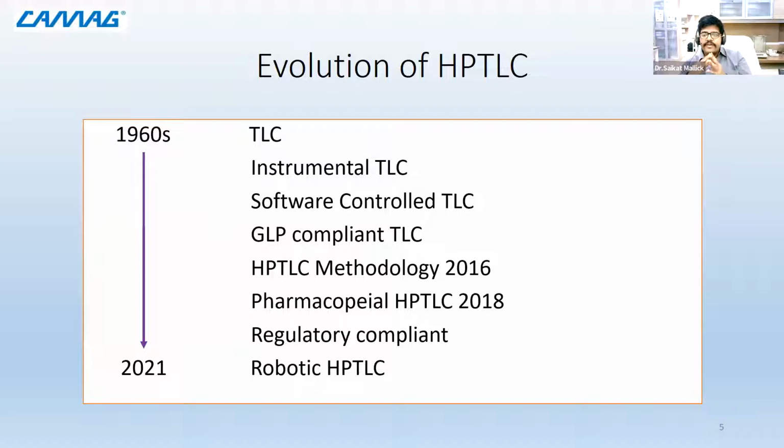So to identify this, it was becoming a slightly older technique, and that is why people used to go for other techniques, and slowly this was used just as an identification test. Although this technique was old, it had the advantages of low cost and quick analytical solutions for many of your research needs.